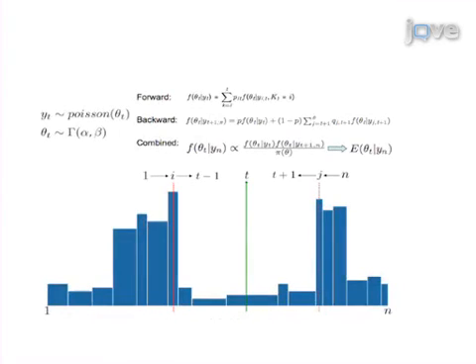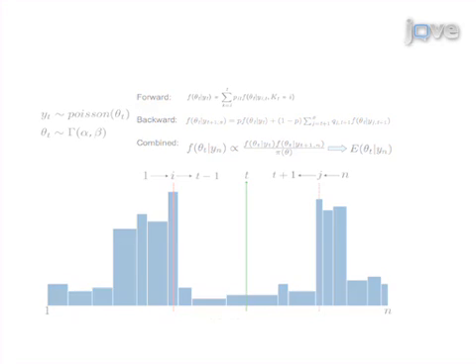As a second step, posterior mean densities of each block are calculated recursively within the context of all surrounding blocks using a Bayesian model with forward and backward filters, where the read count for a block is modeled with a Poisson distribution with a theta parameter that takes on a gamma prior distribution with alpha and beta parameters.